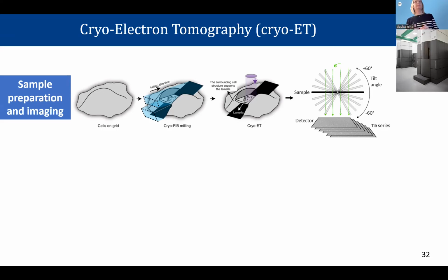Quick question. I was wondering, compared to some of the deep learning reconstruction methods, which maybe have a continuous latent space that we can sample conformations from, but that latent space is not constrained in any way, that more reasonable conformation. Have you done any experiments?